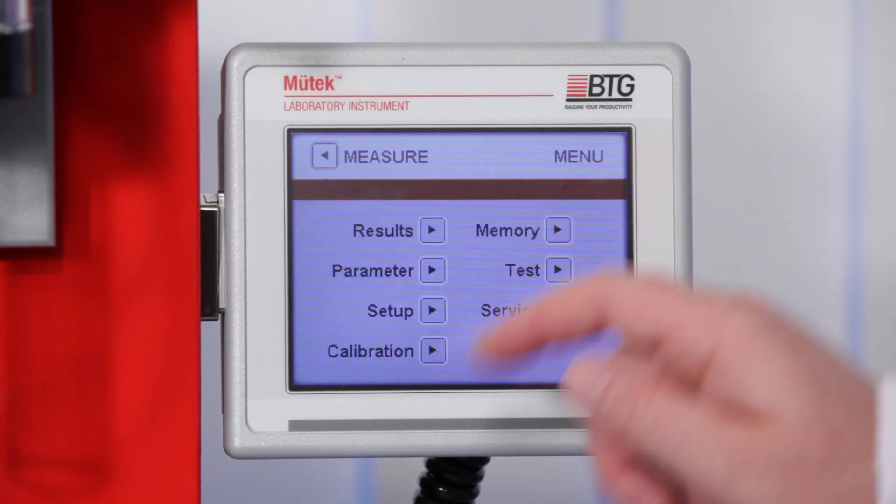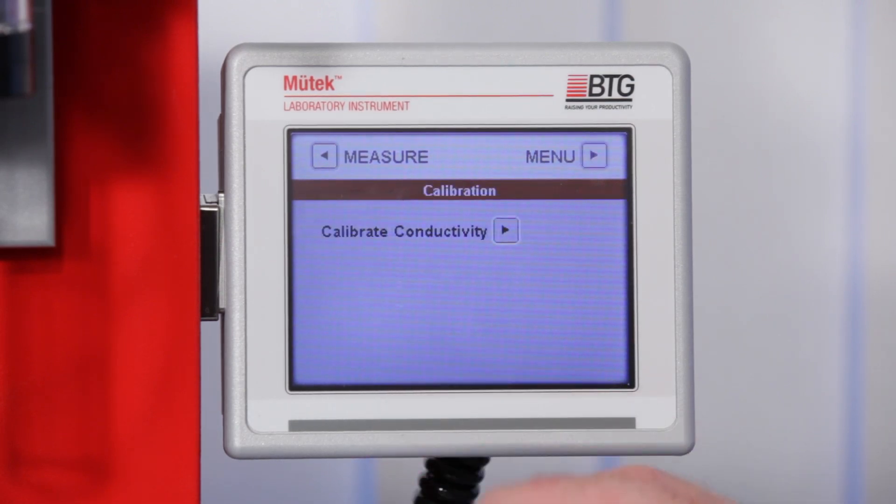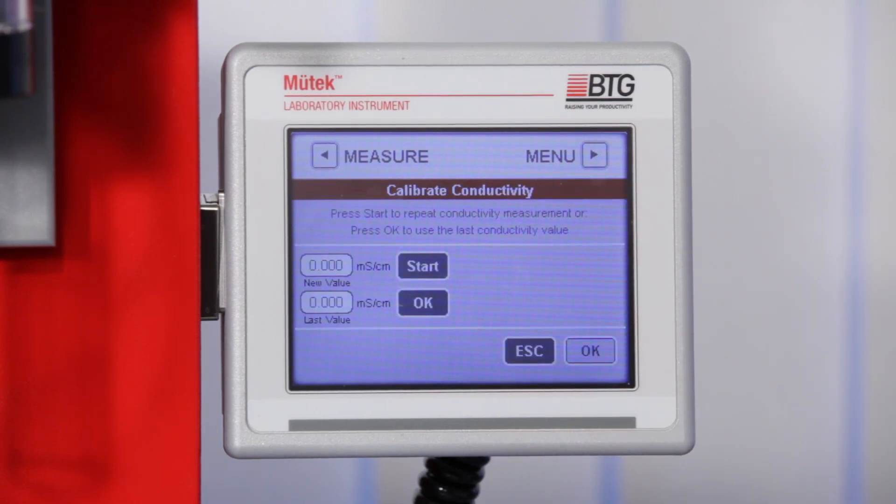Press the Menu button to return to the main menu. In the calibration menu, the so-called EL factor can be modified. The EL factor is used to calibrate the conductivity measurement of the SZP.